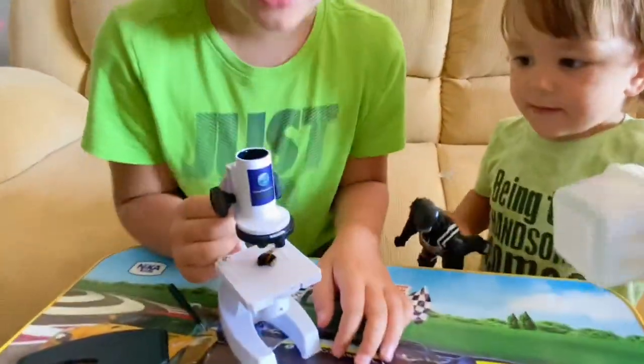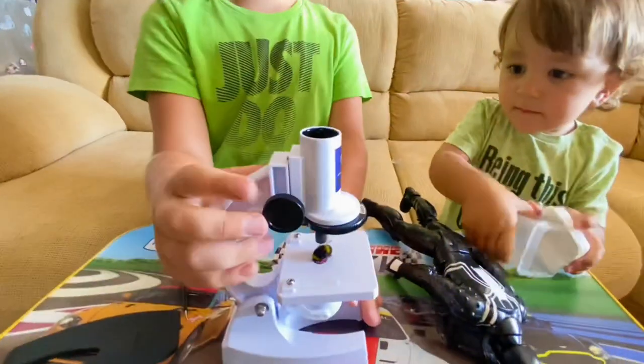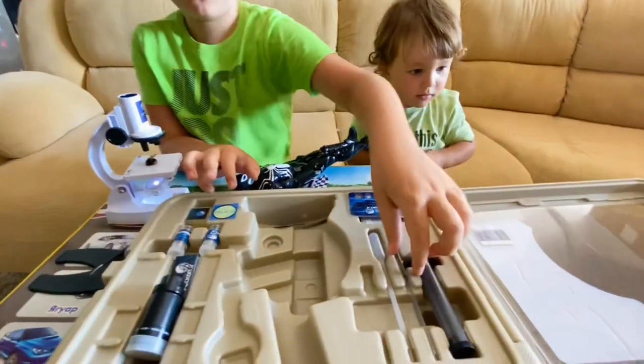Whoa, it's a bee! It looks amazing. It looks cool. Okay guys, next we're going to look at all this stuff and see what we can do with the bee now.